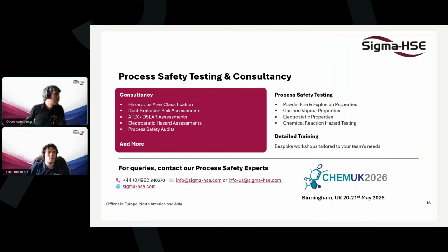Yeah, thanks, Suresh. Luke, do you want to try this one? Which instrument giving TD24 values, such as DSC or ARC, is better suited for the Stoessel criticality class assessment that we were looking at before?